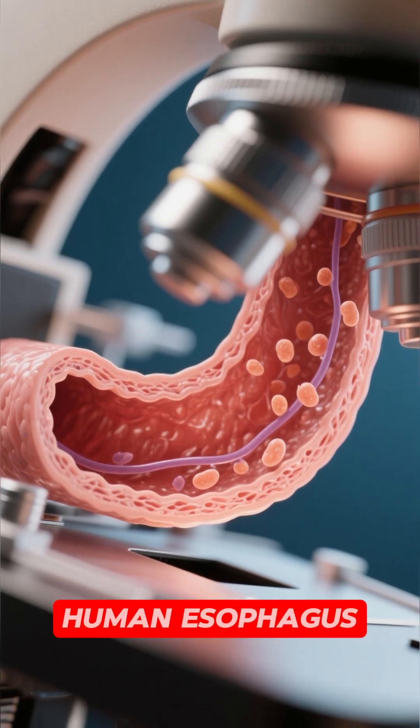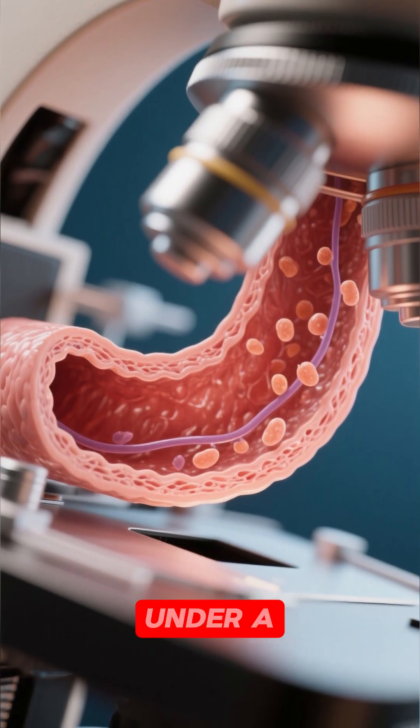Here's an ultra-close-up of the human esophagus. This is what it looks like under a microscope.